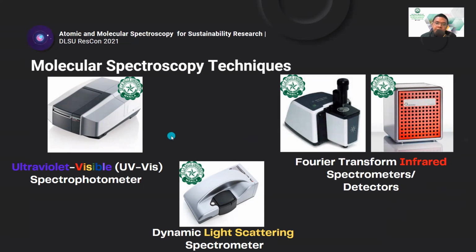So for the UV-Vis, what we actually have here is not only the typical cuvette system, but we have a reflectance system available. So if you need analysis on the reflectance of UV-visible light for your solid samples, then we can do these analyses for you.